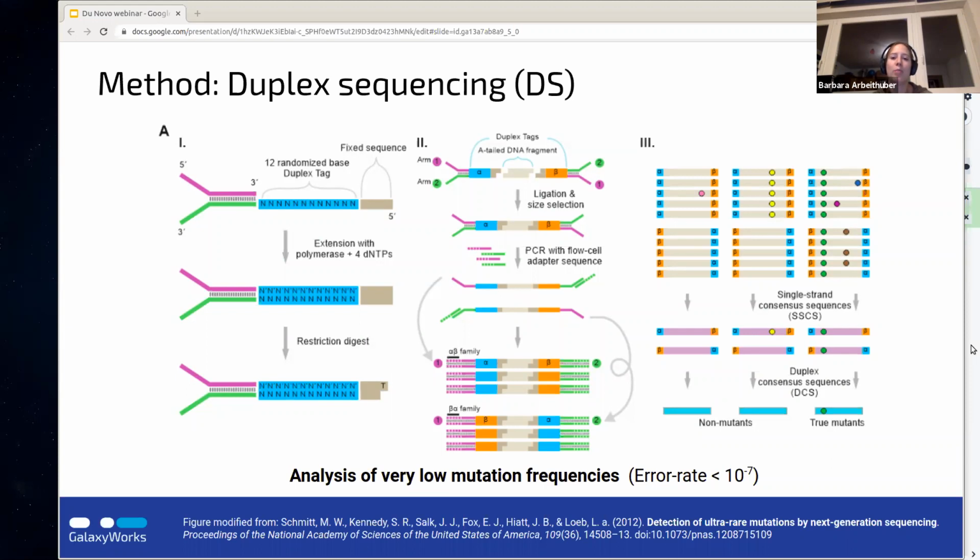But when working with very low DNA input amounts, you want to recover as much sequencing information as possible from your sequencing run. And by doing this initial mapping to a reference sequence, you can lose sequencing information at regions which are, for example, hard to sequence and have many sequencing errors, or also when it involves insertions and deletions.